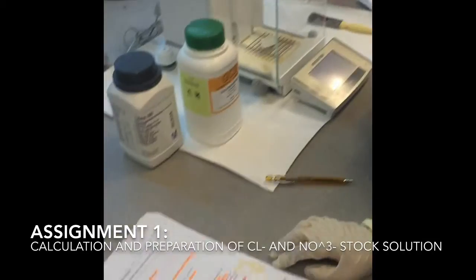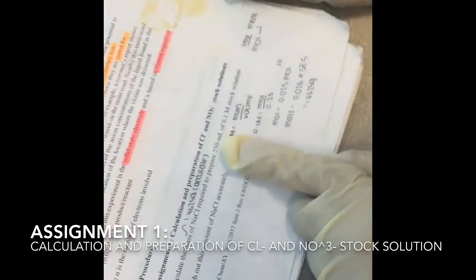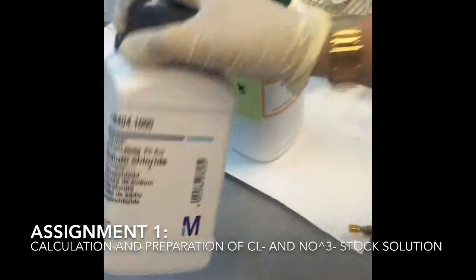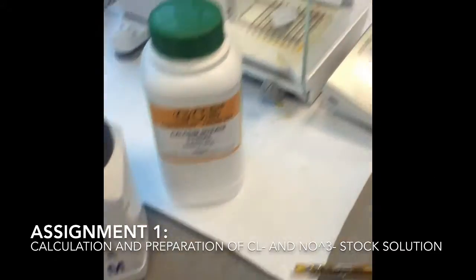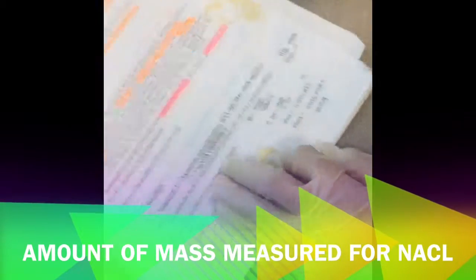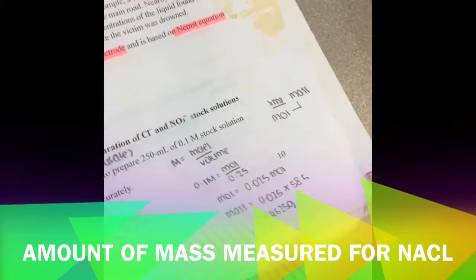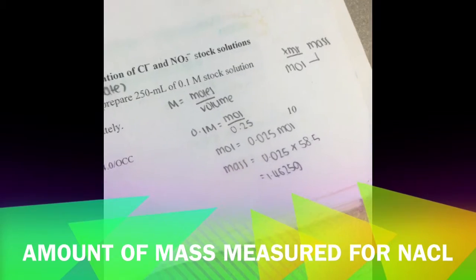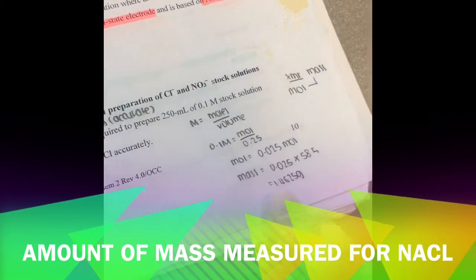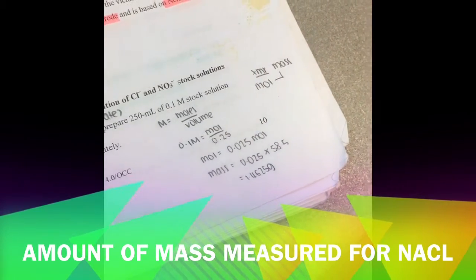So basically in this experiment 3, there are 4 assignments to be done. The first assignment is calculation and preparation of Cl- and NO3- stock solution. What you need is sodium chloride as well as calcium nitrate, followed by spatula and weighing boat. So how much of the mass should you measure? We calculate from the formula of molarity equals moles over volume. You know that 0.1 is the concentration, and hence from here we can derive the mass that we are supposed to measure.